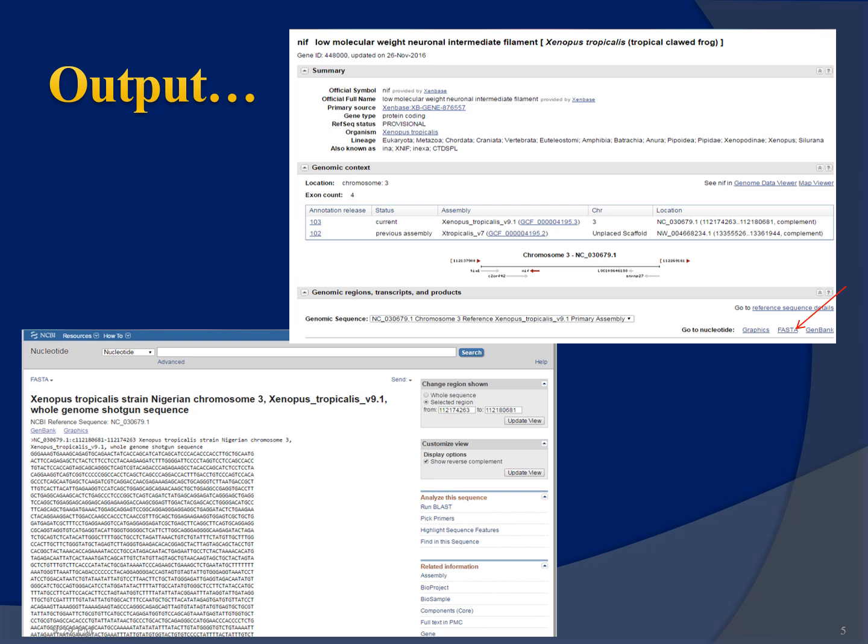I have just chosen one output from the hits displayed, and you can see here that you can get the information in different formats. The most common format we would like to use is called FASTA format. You can see the option on the right-hand side at the bottom of your screen, and when you click it, you will get a picture like this, with an output displayed in this format.